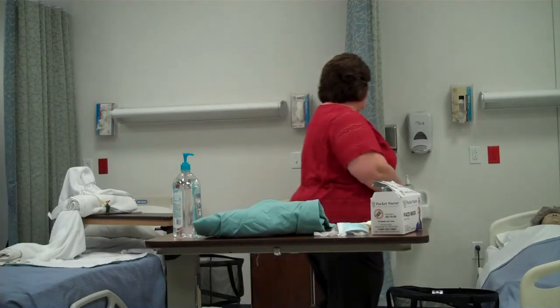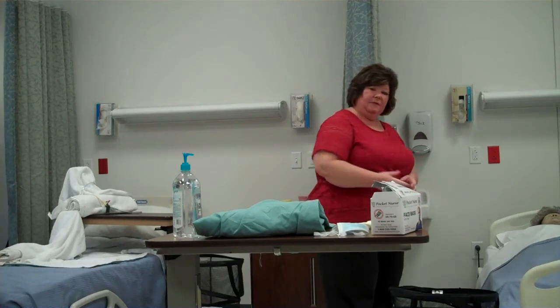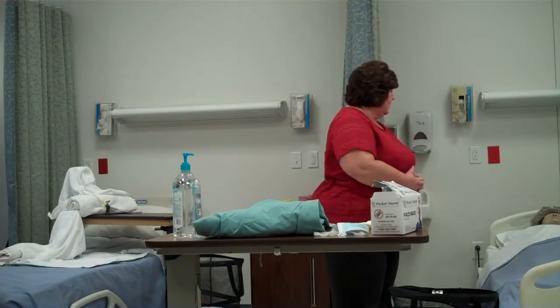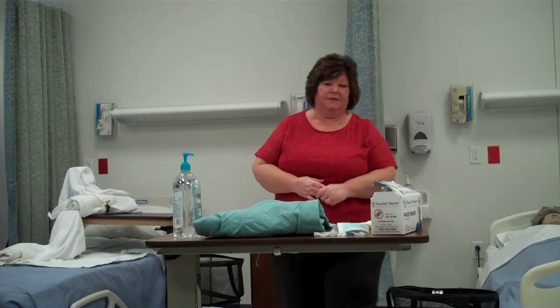Knock, knock. Hi, Mrs. Smith. How are you? That's good. My name is Barb. I'm your nursing assistant. I'm going to get my isolation garb on. First, I'm going to wash my hands, and I'll be right in to take care of you.